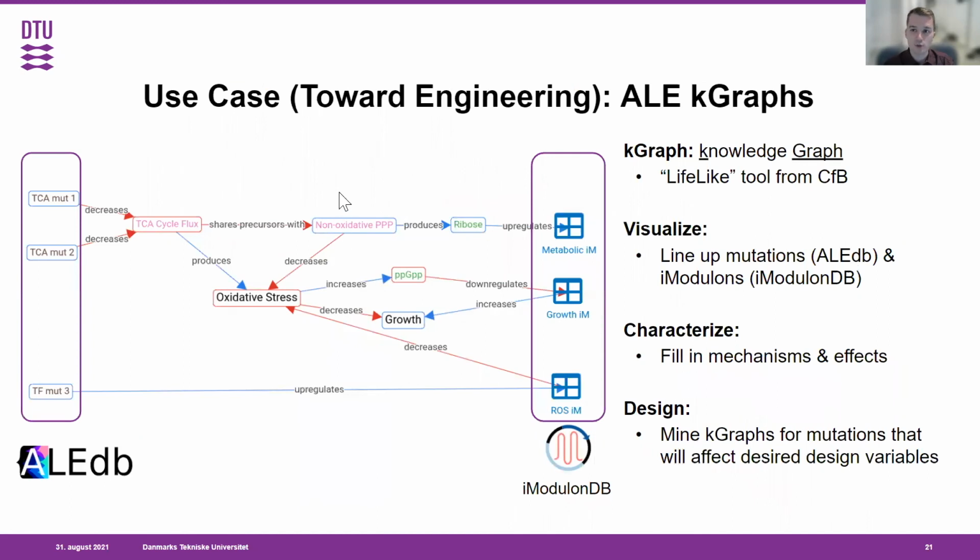Here's one use case which combines both of the databases that I talked about in detail. What we've done here is lined up the mutations from ALEdb on the left and the iModulons that change as a result of these mutations on the right.